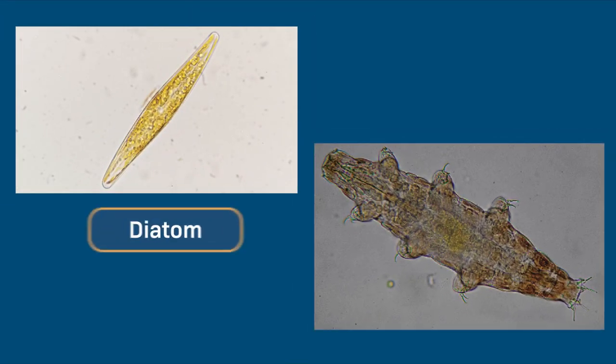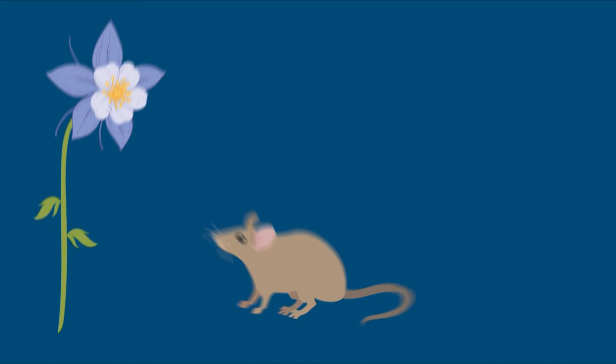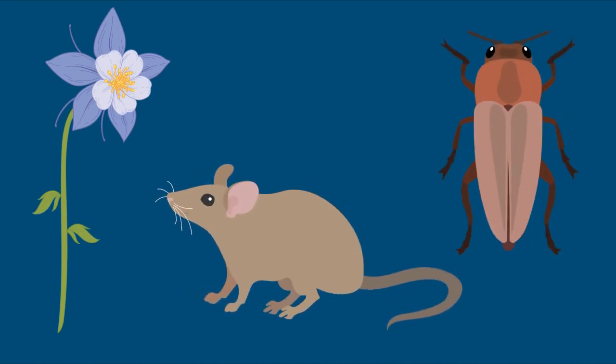Microscope slides are usually just given to us during class, and our job is to record and draw and observe what we see. But ever wonder how they're made? For super small and translucent organisms like diatoms and tardigrades, you can pretty much just slap them on a microscope slide and you're ready to go. But for chunkier life forms, the process is a little more involved.